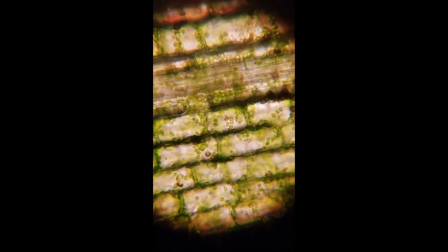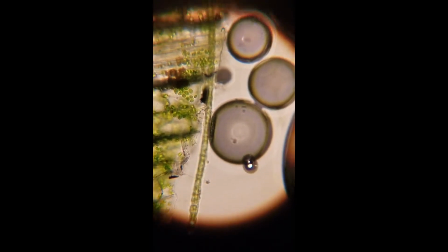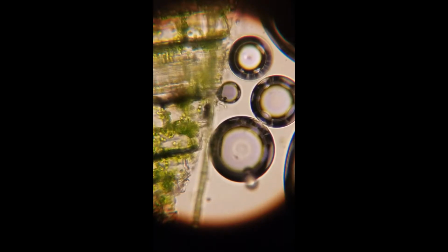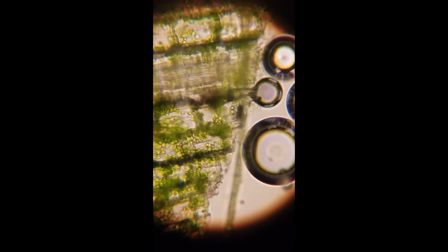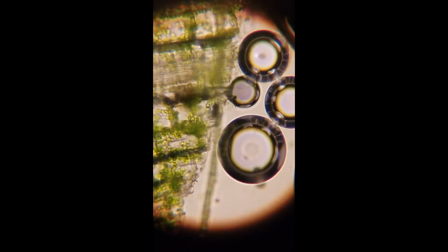So now that we've taken a look at those oxygen bubbles being produced, and now watching them more, I am convinced that that is oxygen being produced in real time by photosynthesis. You can see one coming out there. Normally when you look at a pond sample, these oxygen bubbles are sticking to the algae, and if you shake up a sample of algae, a few bubbles will come up.